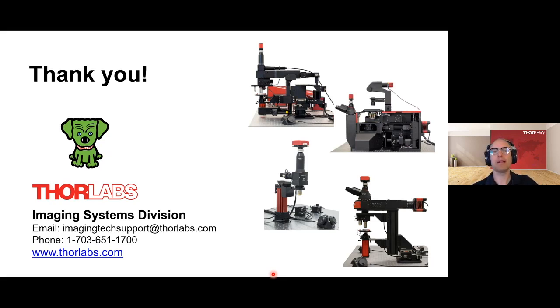Okay, this is a very interesting one. What would be the downside of the resonant pair of scanners? A resonant scan pair has been done. It sets up a kind of spaghetti-like scan pattern, a series of curves. I guess it looks like if you took an Etch-a-Sketch and shook it around, you get a series of circles that scrawl out scribbles all over the image.